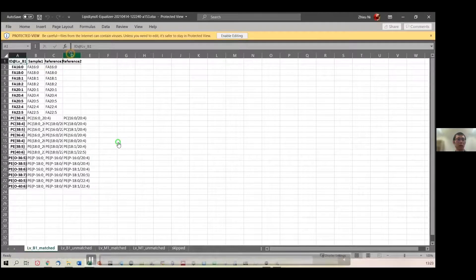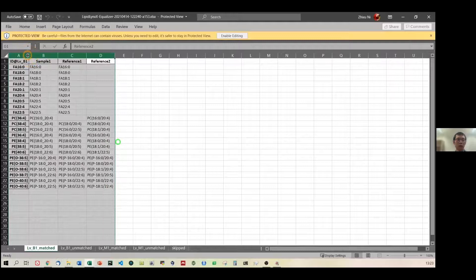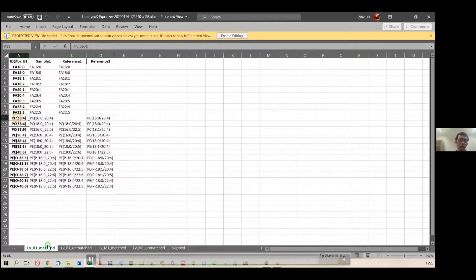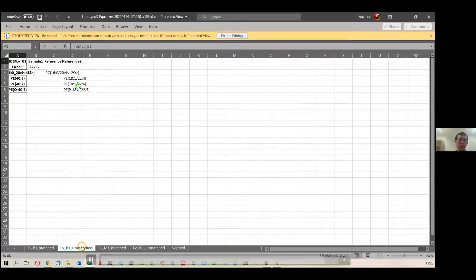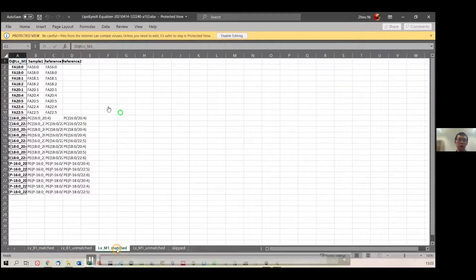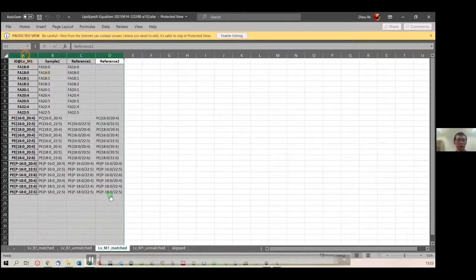In the Excel table, you will see it organized with matched ones and unmatched ones. You can also have a look at the matches at the molecular species level.